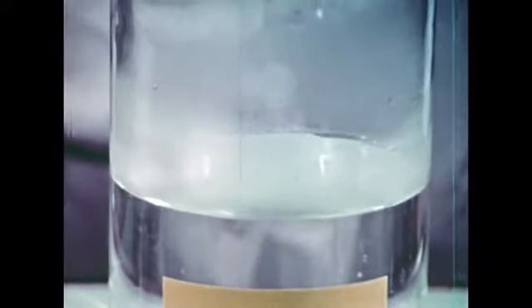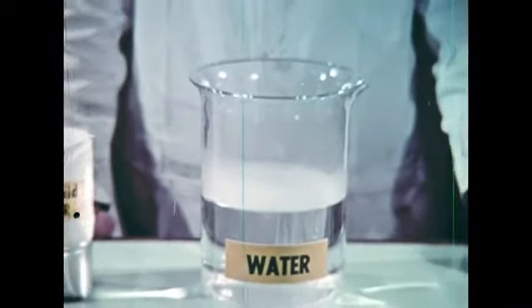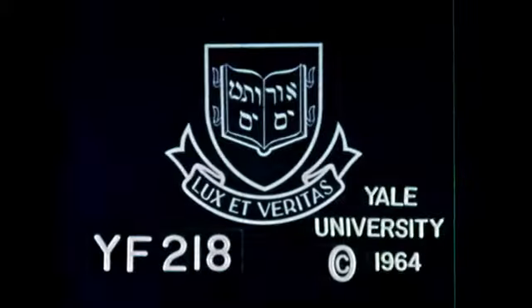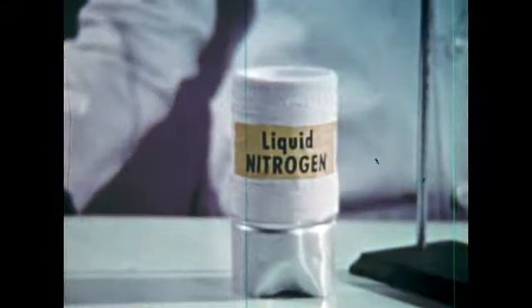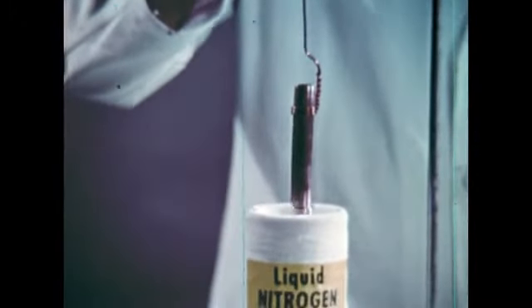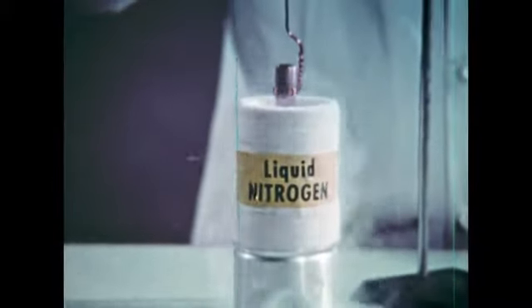We're blowing the vapor out so you can see the remaining globules of liquid oxygen skittering around on the surface of the water. This time we're using liquid nitrogen as a refrigerant for this hollow copper tube, which we'll fill to bring its temperature below the boiling point of oxygen. The nitrogen is spitting and boiling over as we cool the copper tube down to the temperature of the very cold liquid nitrogen.